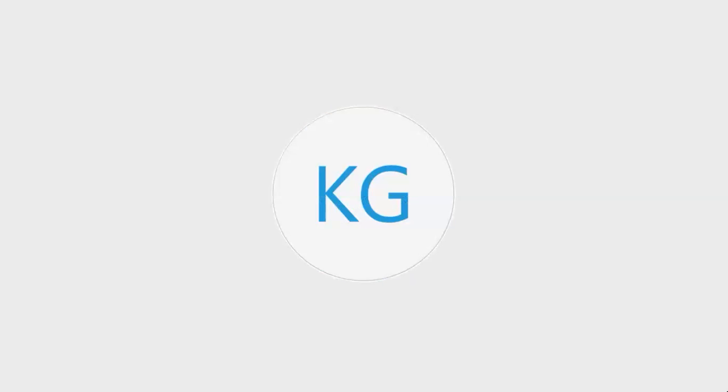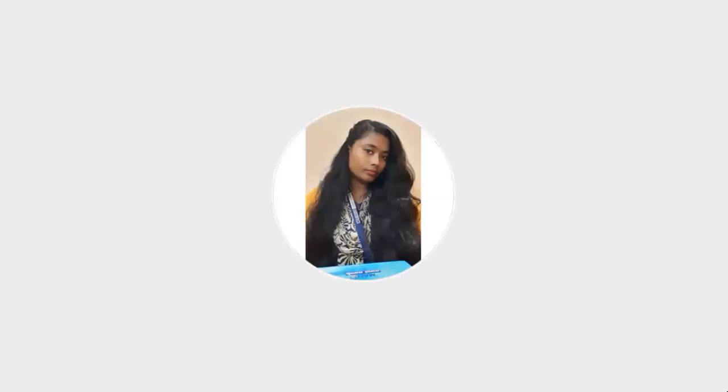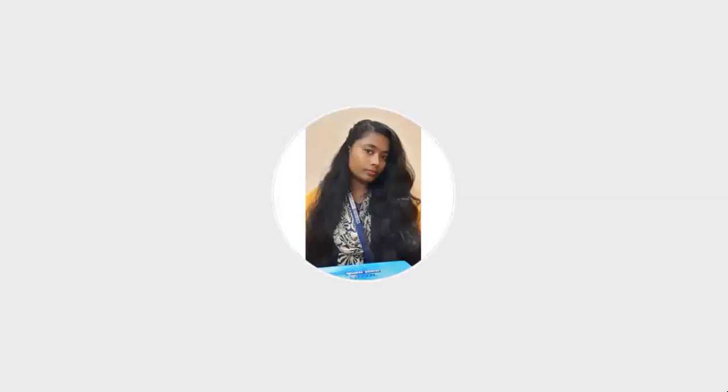Can you explain where from where to where it's acidic, and from where to where it's basic? From 1 to 7, it's acidic, and from 7 to 14, it's basic. And 7 is what? Neutral, ma'am. Okay. So all of you can give your answer like that.